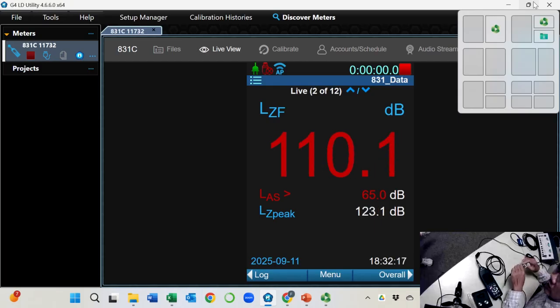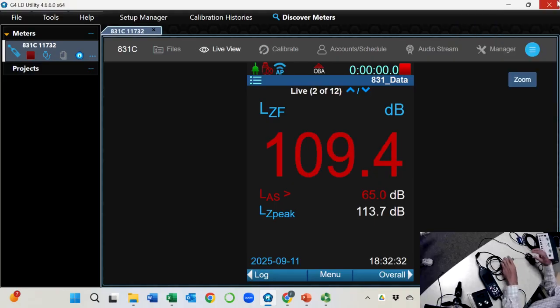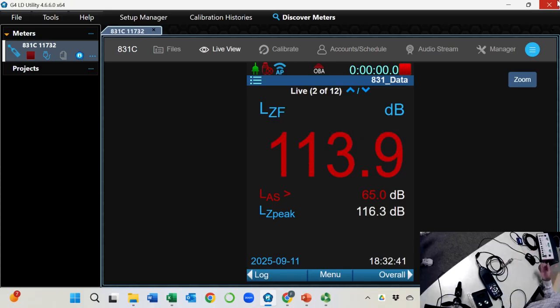I do it to make you laugh for a purpose, so you have to remember it. Because if I don't push it all the way in, the chamber inside may not be 2 cc. It will be slightly bigger, and that will affect the calibration results. Okay, all right. The sound is ongoing. I can hear it. I cannot hear it. Good thing, it's not leaking.